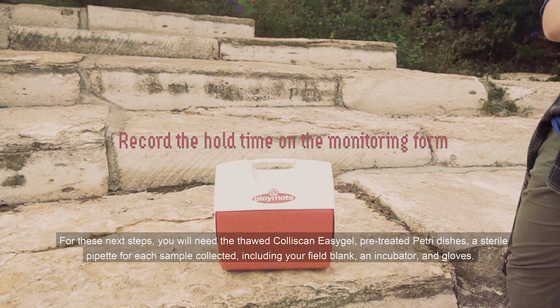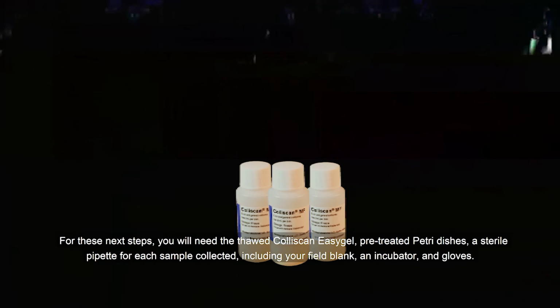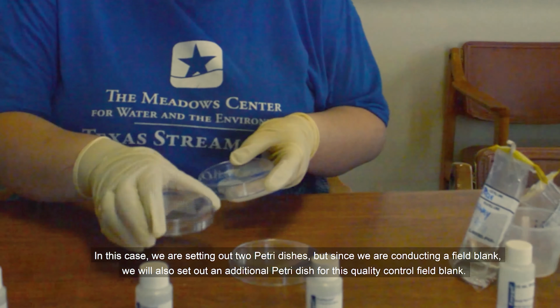For these next steps, you will need the thawed Coliscan Easy Gel, pre-treated petri dishes, a sterile pipette for each sample collected, including your field blank, an incubator, and gloves. Be sure the pipettes stay in the sterile wrapper until it is ready to be used. Put on gloves and set out 2 petri dishes for each sample you collected. In this case, we are setting out 2 petri dishes.